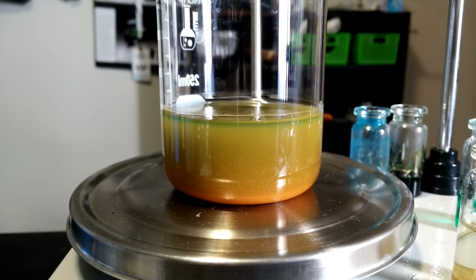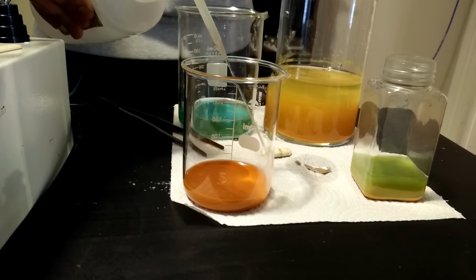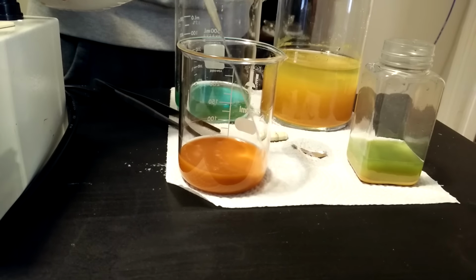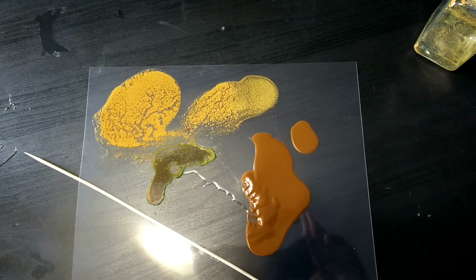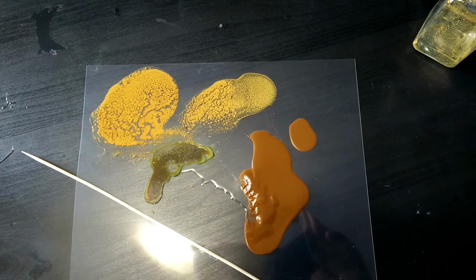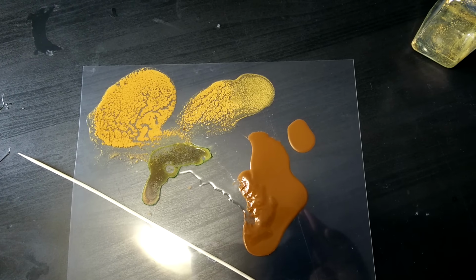When you've got your solution the right color, let it settle and decant off as much of the liquid as possible. Then add some deionized water to wash and then allow it to settle again. Repeat this 2 or 3 times and then finish with a wash of acetone. If you don't wash sufficiently, then when you go to dry the material, you'll end up with a green mush mixed in with your oxide, which isn't ideal. The nice thing is that if there is any copper contamination in your particles, when you dry it out, the copper particles will oxidize to copper oxide, so you'll just end up with a more brown-orange powder.